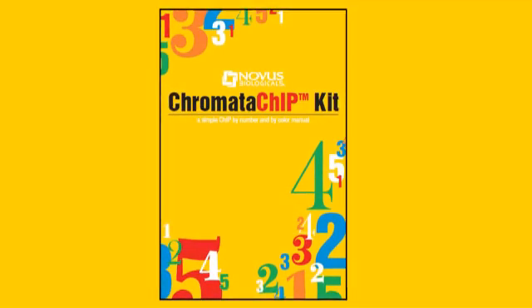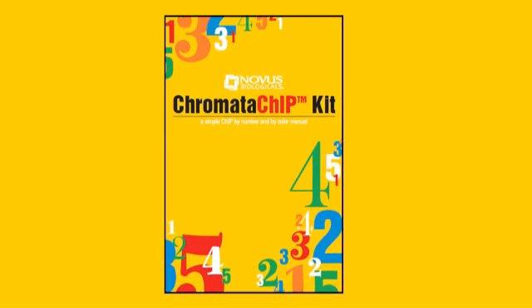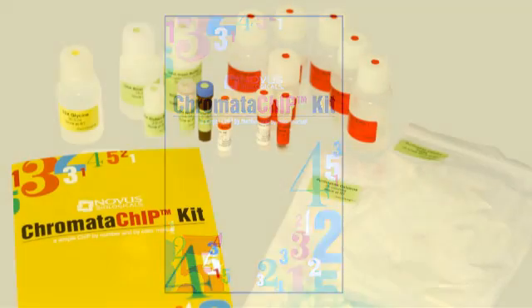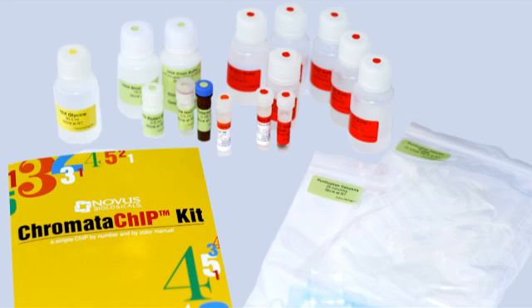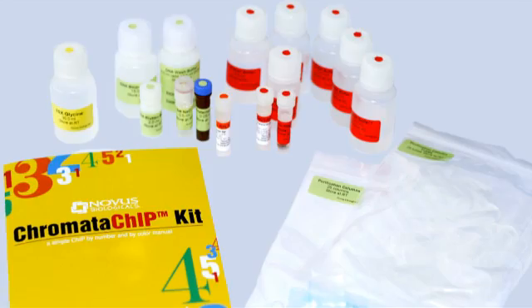This visual ChIP protocol follows the written version located on the support section of our website as well as the protocol for the Novus ChromataChIP kit. This kit includes all the components necessary for you to perform a successful ChIP the first time you use it.